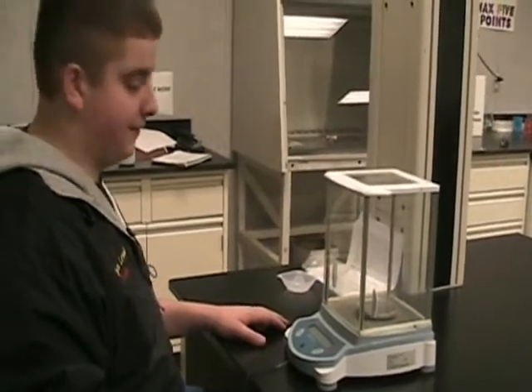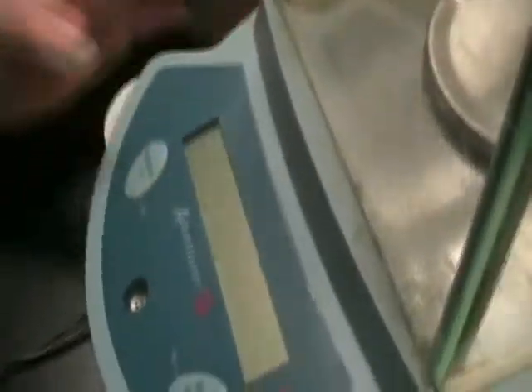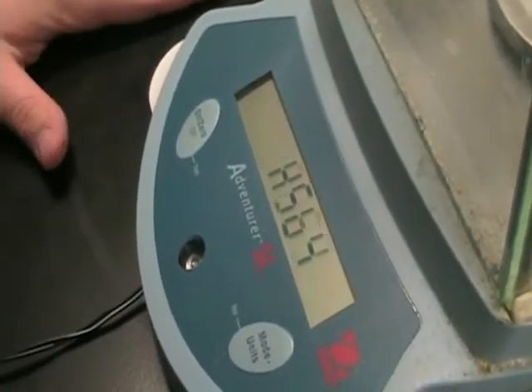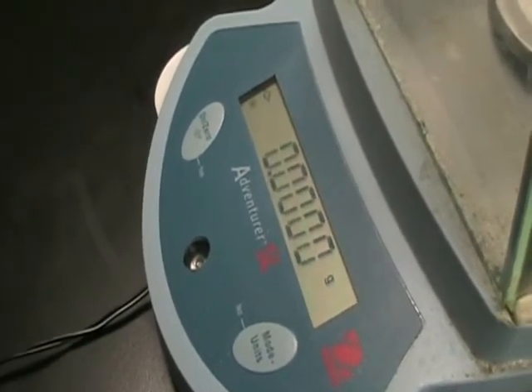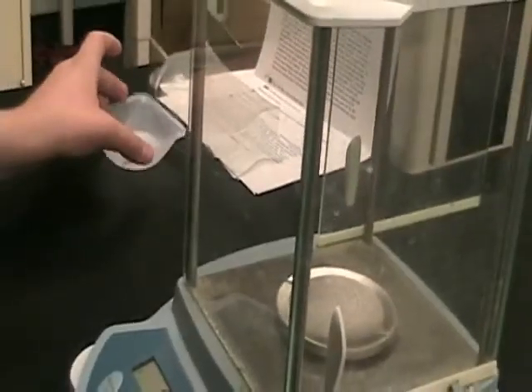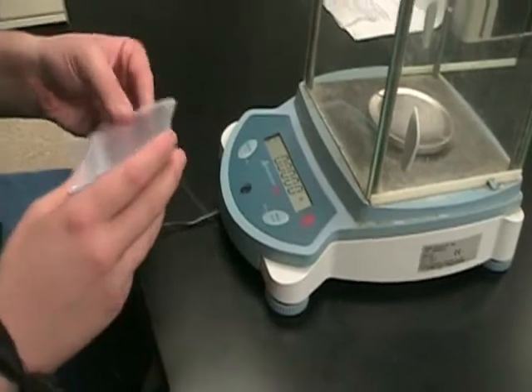Now, press the on button and your scale should turn on. First it will do its computer calibrations. As soon as all the zeros pop up, it's ready to go. Now insert your weigh boat. You always want to use weigh boats — never use weigh paper. Always use a weigh boat, because that's the best thing to use for this scale.